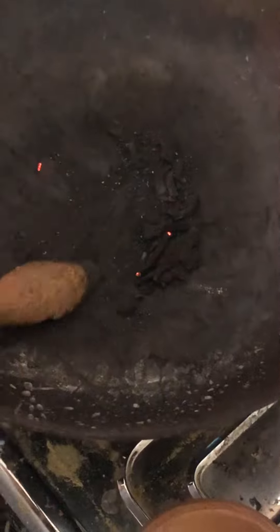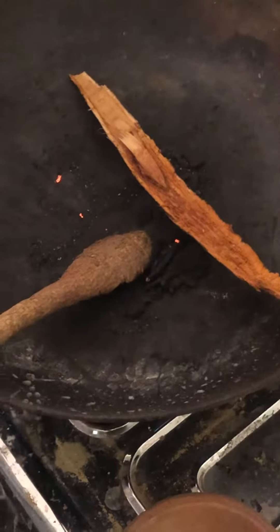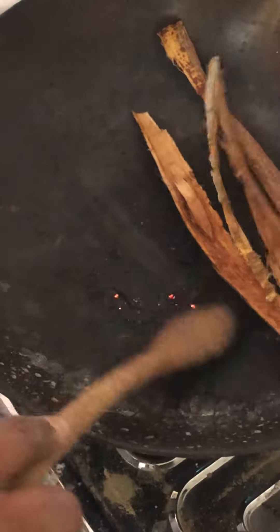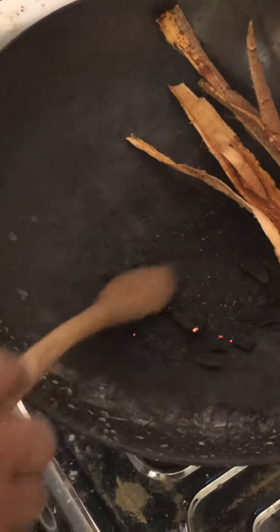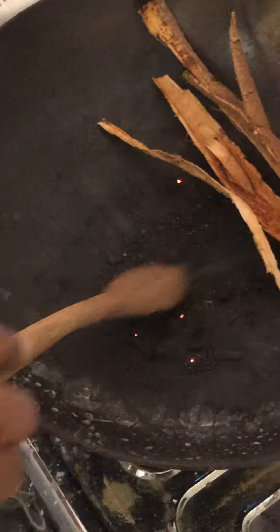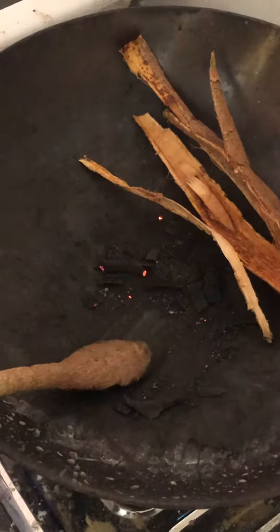Then the pan will be right. I have to add a little bit to the pan. I will add some salt in the pan. I will add some salt to the pan.